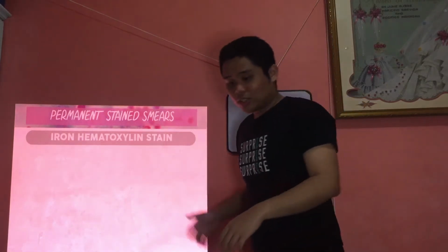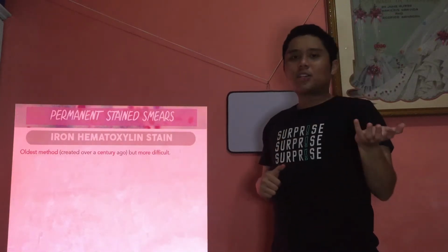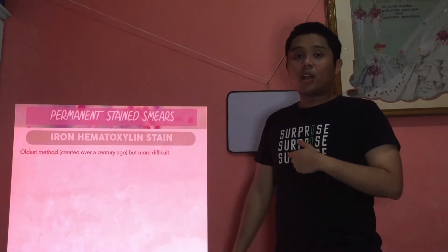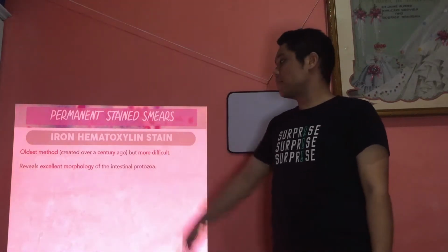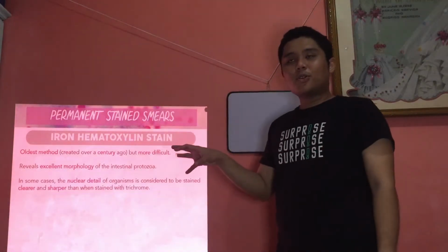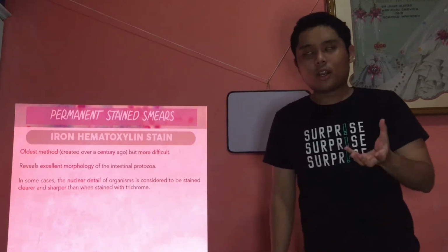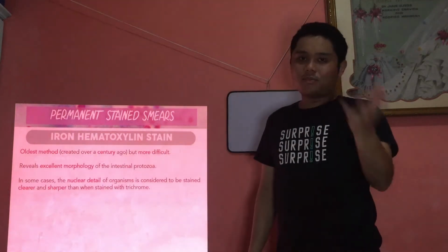Again, the iron hematoxylin stain. The iron hematoxylin stain is considered to be the oldest method because it was created over a century ago. It's one of the earlier stains used for staining parasites, but it was more difficult to perform. This stain reveals excellent morphology of your intestinal protozoa, and in some cases also the nuclear detail. The nuclear karyosomes and nucleus are much more stained, considered to be stained much clearer and sharper than using trichrome.